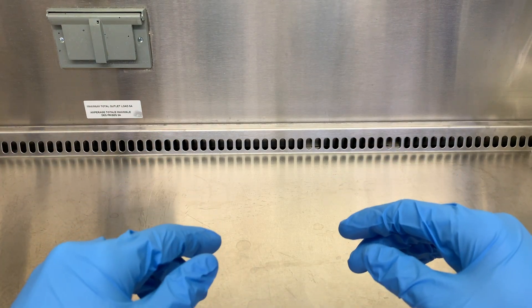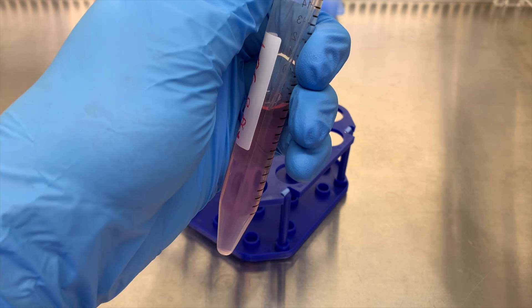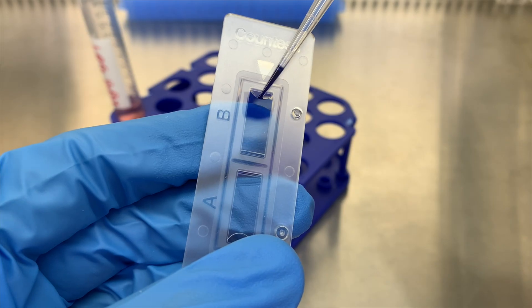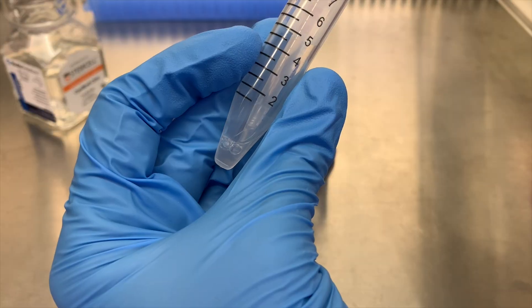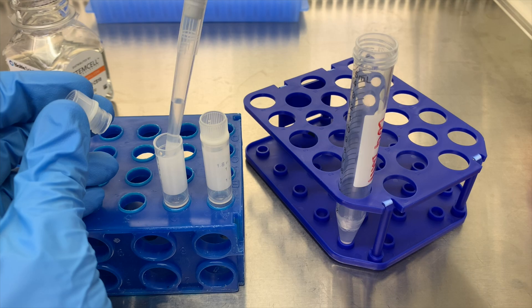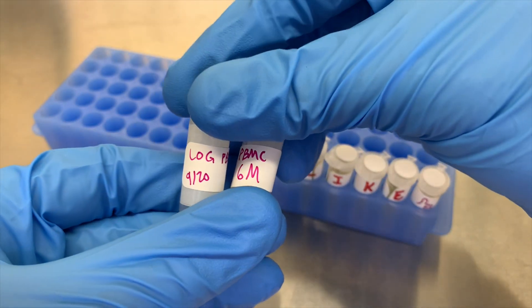Hey guys, welcome to the first video on this channel. Today we'll go over how to Ficoll blood, a technique used to separate plasma, PBMCs, and red blood cells from whole blood. This is a pretty common procedure, especially if you need to isolate lymphocytes. In this video I'll give a quick summary of what a Ficoll is for, and then go through the procedure step by step in detail. At the end I'll go over some common issues and how you can try to fix them.